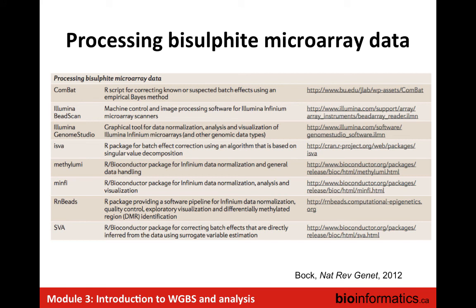A quick note: yesterday there were some questions on tools, and it's always a challenge to figure out what tools to use to do the analysis. Again, we won't go over these tools in much detail because that's not what we'll cover here. But for the microarrays there are a lot of quite mature tools, whether it's the Illumina GenomeStudio package, which comes with these chips that are frequently used, or RnBeads. So there are a lot of pretty mature packages for bisulfite microarray data analysis, but this is not what we'll cover too much.